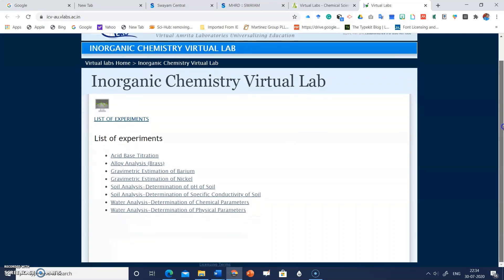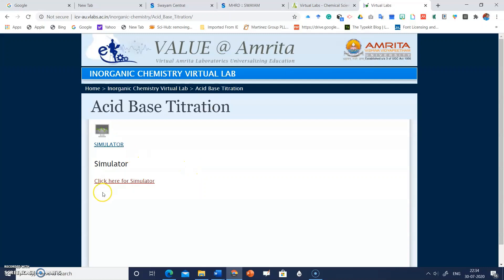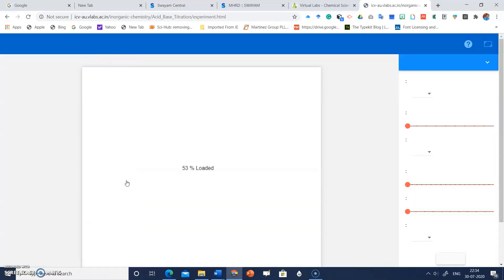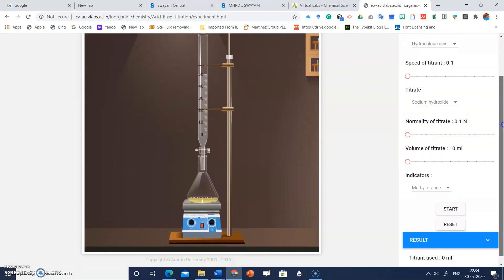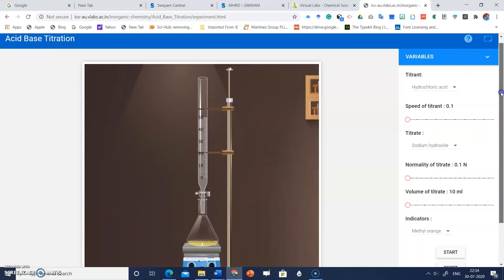Let's start with inorganic chemistry. Click on 'Inorganic Chemistry Virtual Lab.' There is a list of experiments — choose any from the list. Let's take the example of acid-base titration. Click on 'Acid-Base Titration,' then click here for the simulator. The simulator will load in a few seconds.